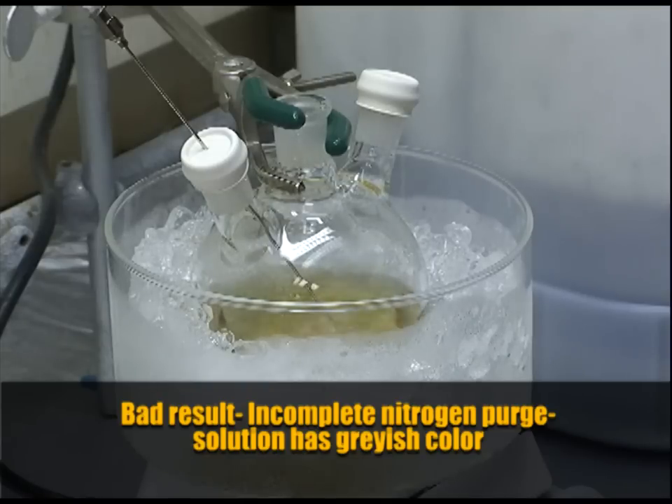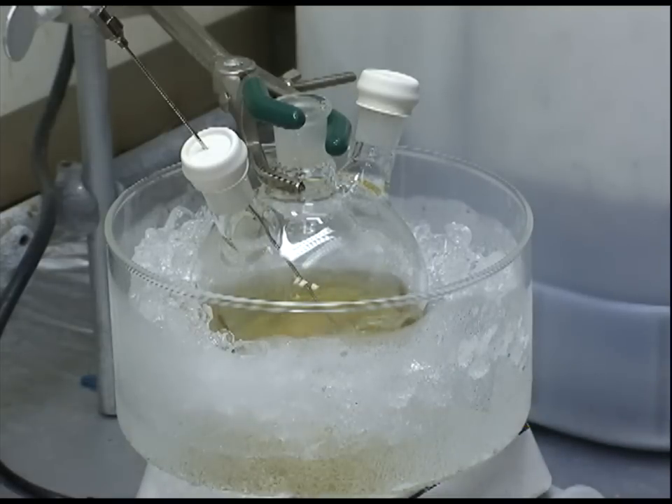This second setup has only been purged for about half an hour. As we add the sodium borohydride, the color does not change to a pale yellow. Instead it changes to a slightly grayish yellow, and the hint of gray indicates that it has not been purged sufficiently and the rest of the reaction will likely not go as desired.